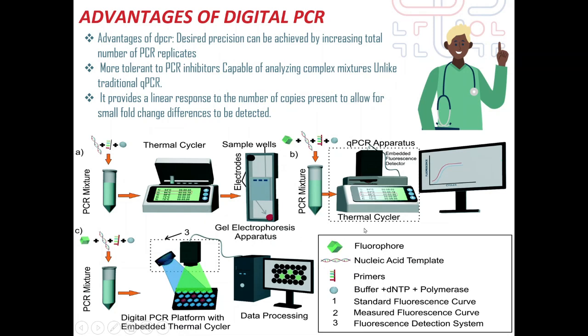Second step is to run and amplify. The plate is processed in the priming/rolling module, where the reaction mix of each well is partitioned into 1,000 little individual reactions. PCR is performed on a thermocycler. Thirdly, we have to analyze the dPCR result. Depending on our dPCR system, select the application to view a heat map, histogram, etc.